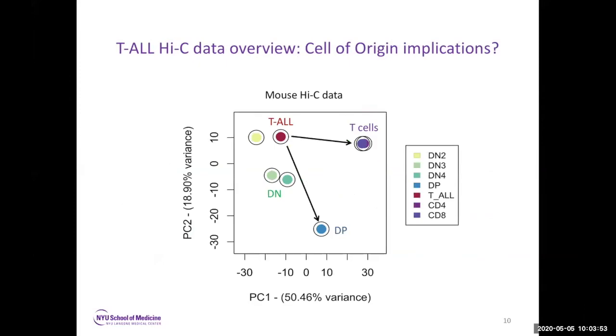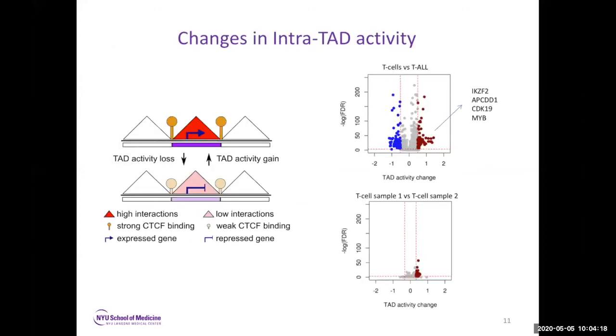That now, and this is unpublished, basically poses the question, what is the origin of all of these subtypes of ALL? So now what we're doing in the lab is that we are basically combining a lot of sequencing of primary and normal stem cell and thymocyte and T cell subsets and compare them with different types of ALL. So we have done a lot of analysis, and you can take a look at the paper. Today I'm just going to tell you two stories.